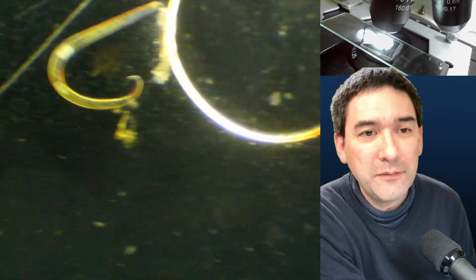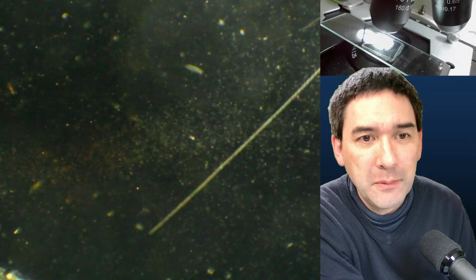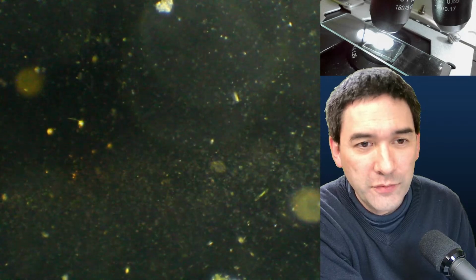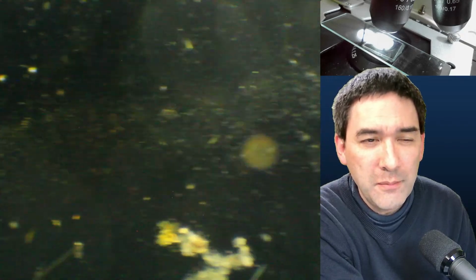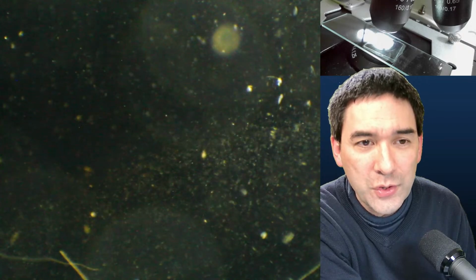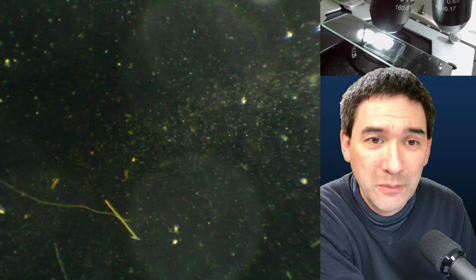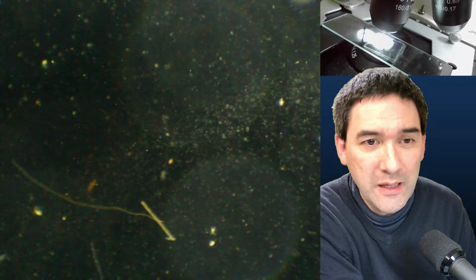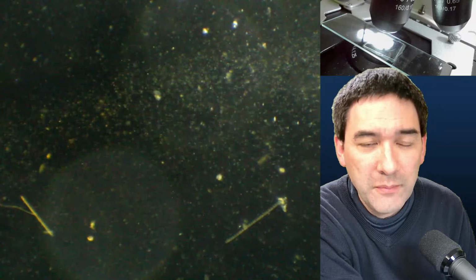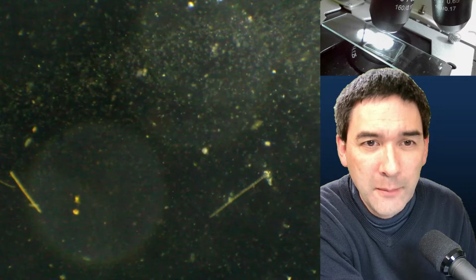So my suggestion is because of my previous videos that I've made. That's actually one of the reasons for this live stream. I've sometimes demonstrated phase contrast and people immediately wanted to upgrade their microscope to phase contrast. Then it's not always possible, and it's expensive. I'm trying to say it's not necessary. Before you do any expensive upgrades or buy yourself a new expensive microscope, try playing around a little bit with those homemade filters.